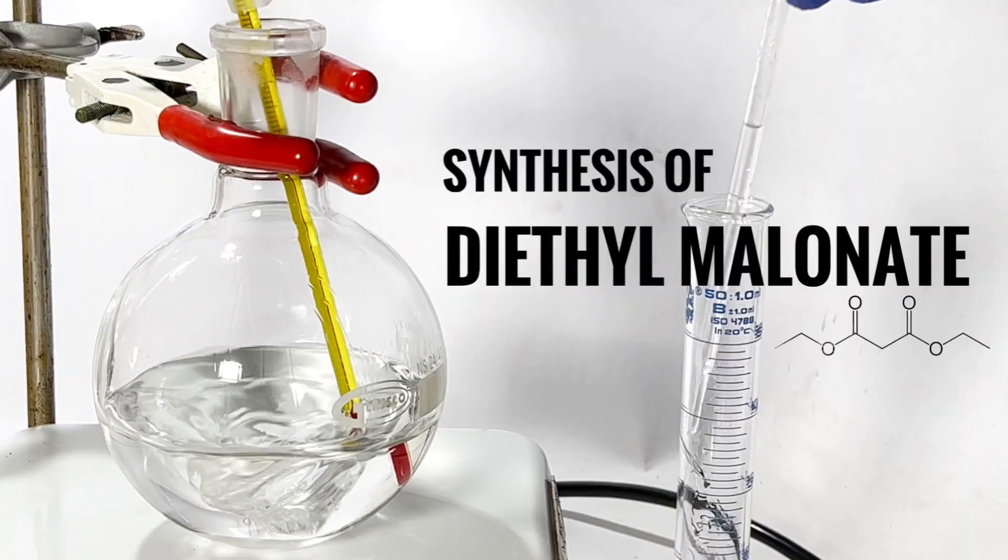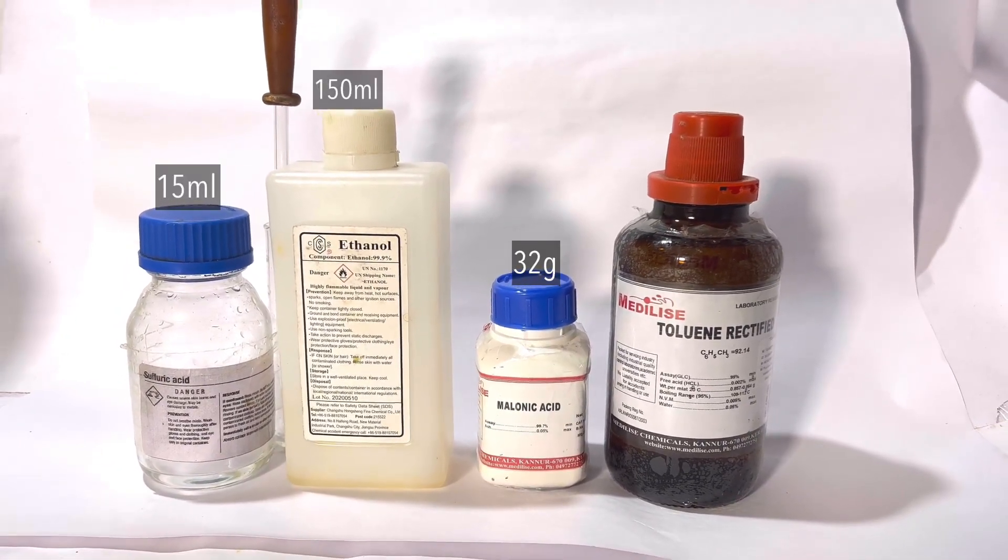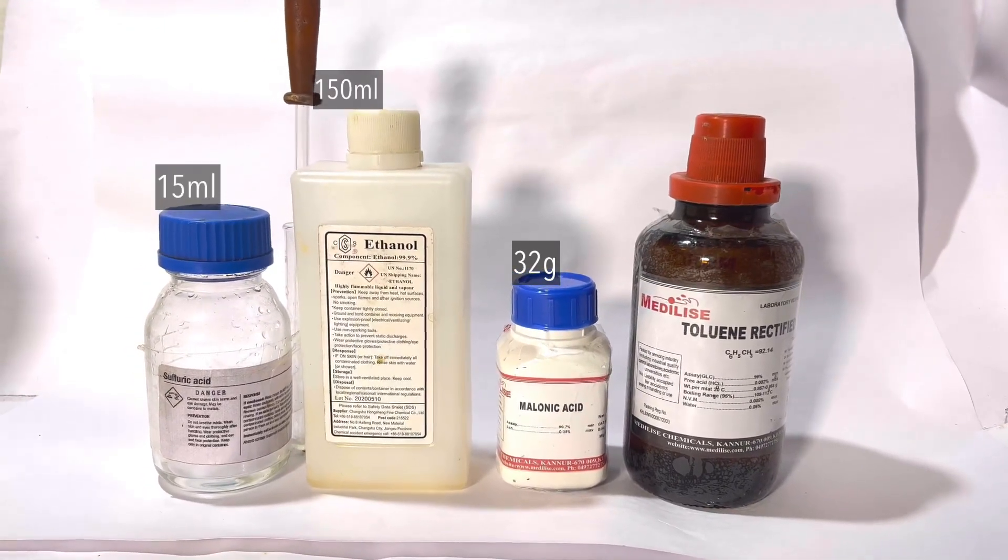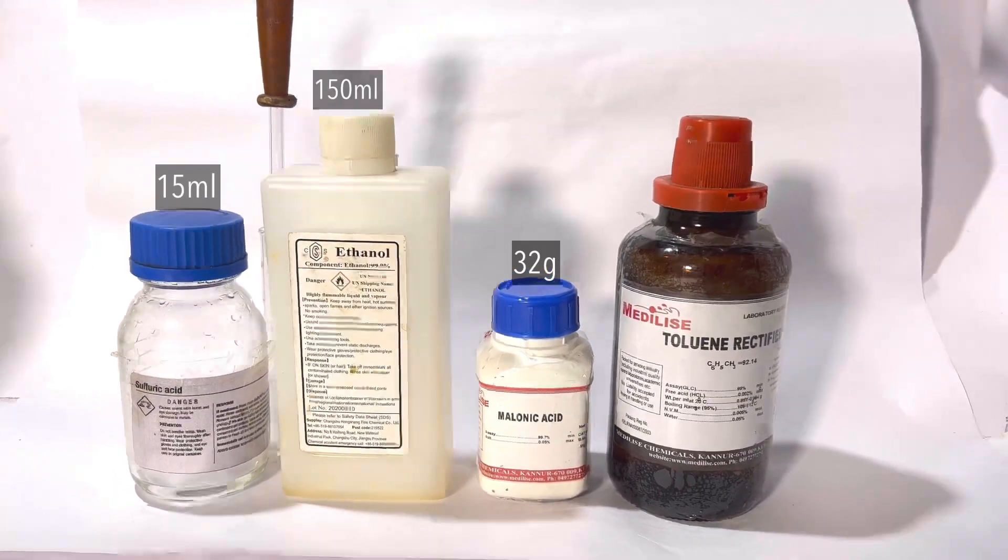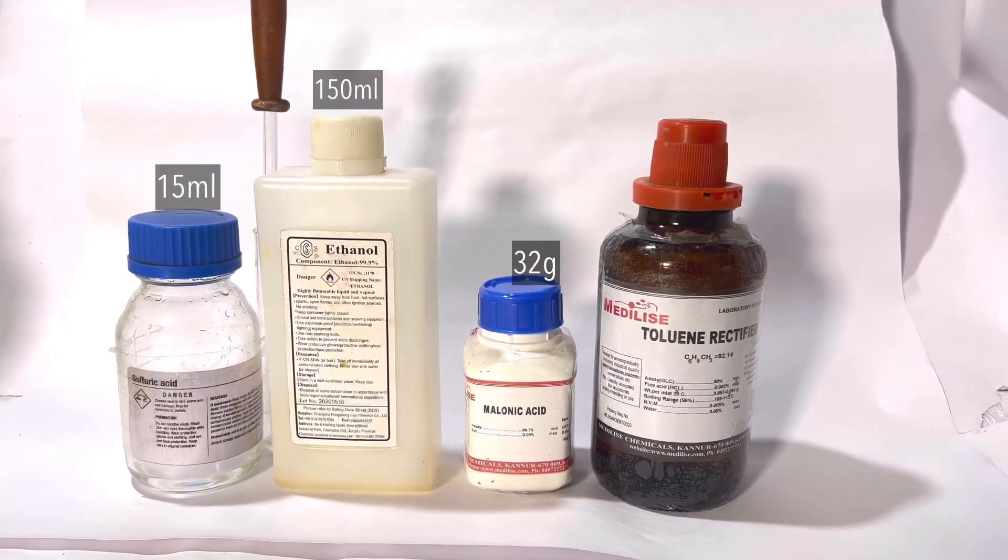Hello friends, in this video we will synthesize diethyl malonate via the Fisher esterification method using malonic acid and ethanol. Concentrated 98% sulfuric acid will be the catalyst. The chemicals required are 32 grams of malonic acid, 150 milliliters of absolute ethanol, 15 milliliters of concentrated 98% sulfuric acid, and toluene for solvent extraction.